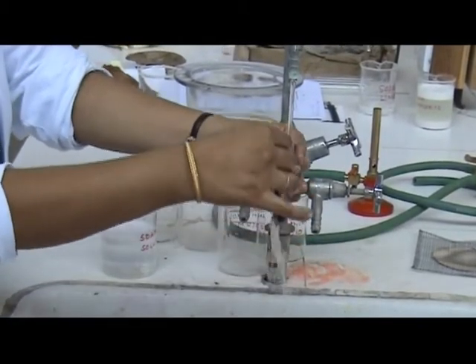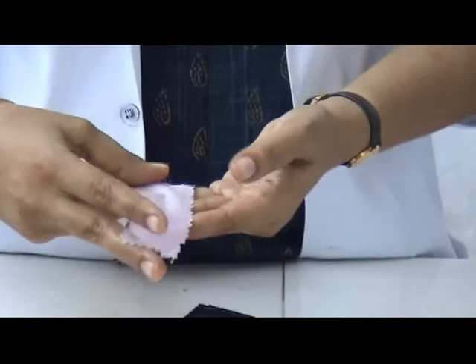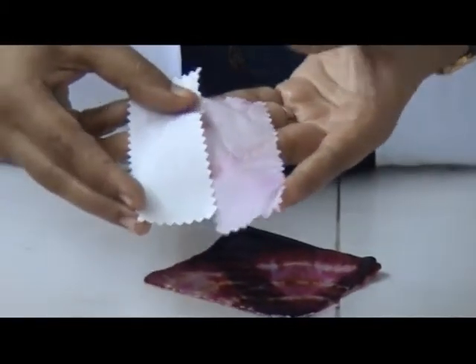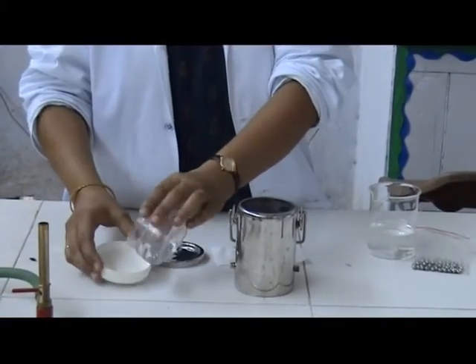The change in colour of the uncovered portion of the dyed printed specimen was assessed with greyscale. The change in shade and staining of the undyed material was also assessed with greyscale.